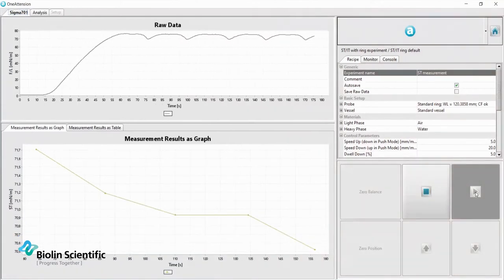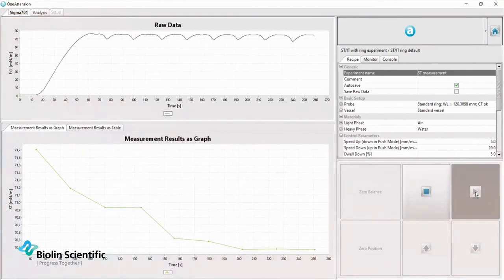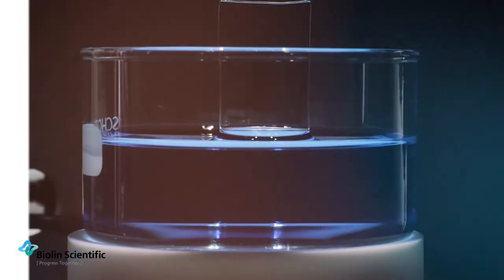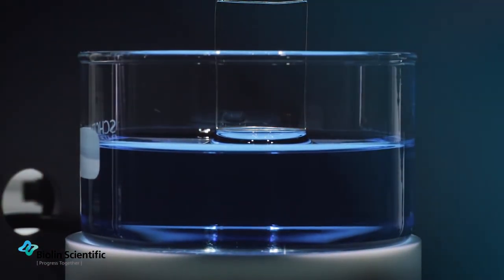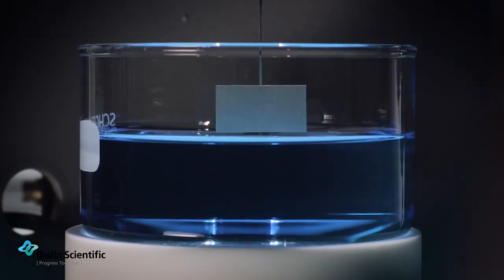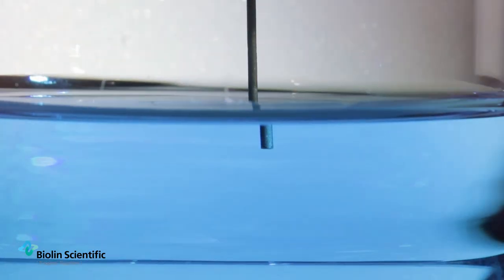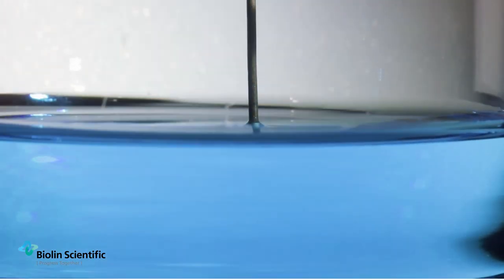The maximum force is detected and the One Attension software turns this force into the surface tension. There are multiple probes available such as the most used Du Noüy ring, a traditional Wilhelmy plate and a Wilhelmy rod for small sample volumes.